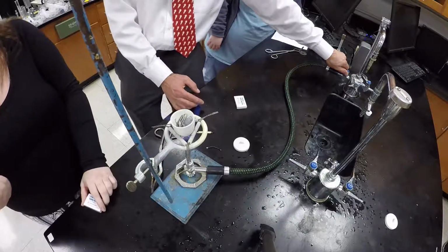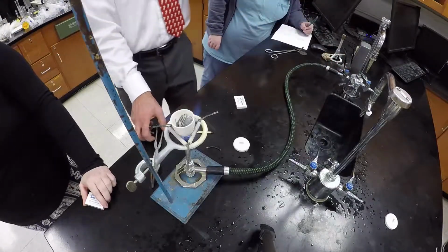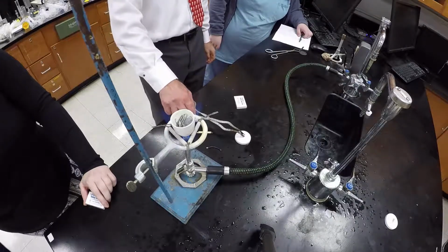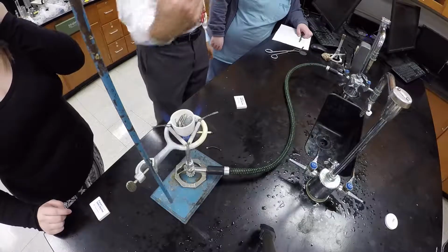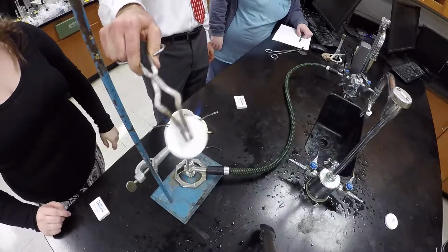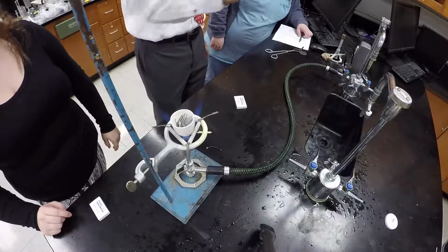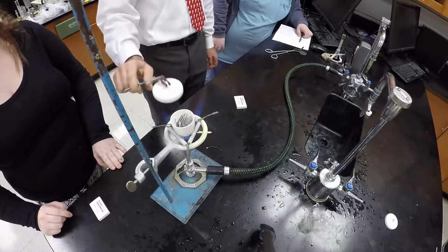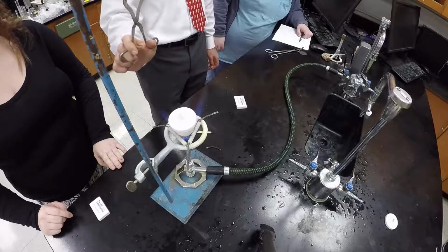Fantastic. Now, to hold the crucible lid, you want to grab the crucible like this. Does everybody see how I'm holding it there? You want to hold it tight, and you place it on here like this.